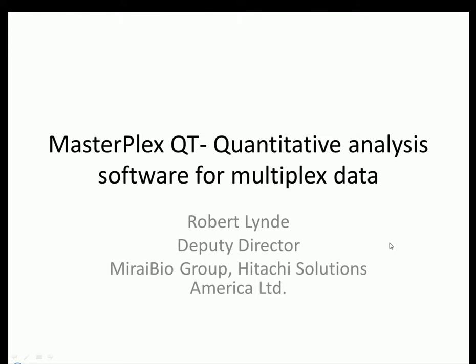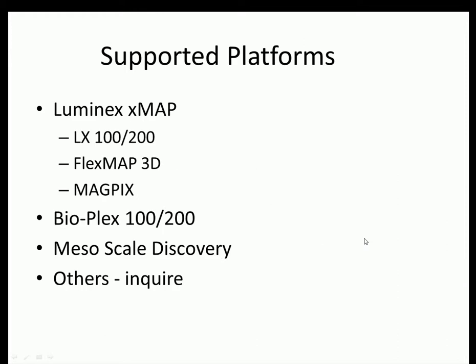I'm going to discuss MasterPlex QT in this webinar. MasterPlex QT is our quantitative analysis module specifically for multiplex data sets. So before I actually get into the application, I've got a couple of slides. The first one discusses supported platforms.